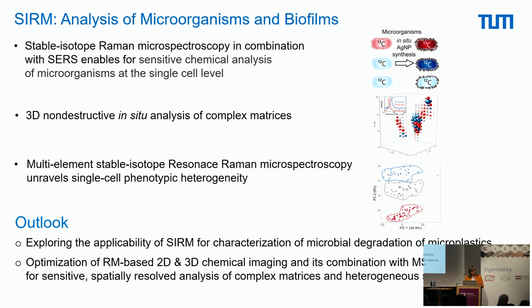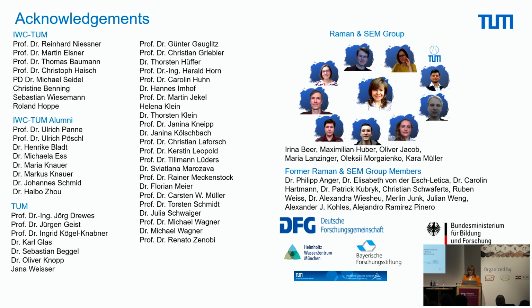And here we are working further on the applicability of the stable isotope approach for the analysis of degradation of microplastic. It's Kara's work. And we also plan to optimize Raman-based 2D and 3D images and combine them with mass-based techniques for sensitive and spatially resolved data.